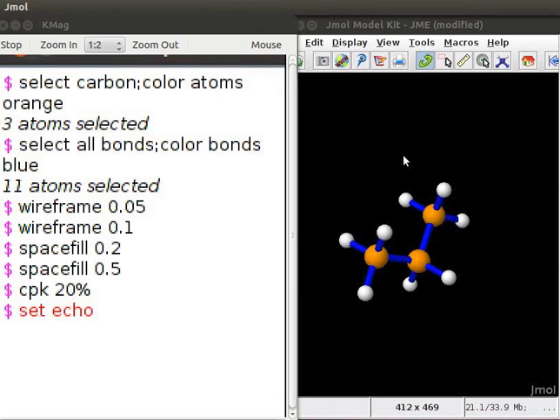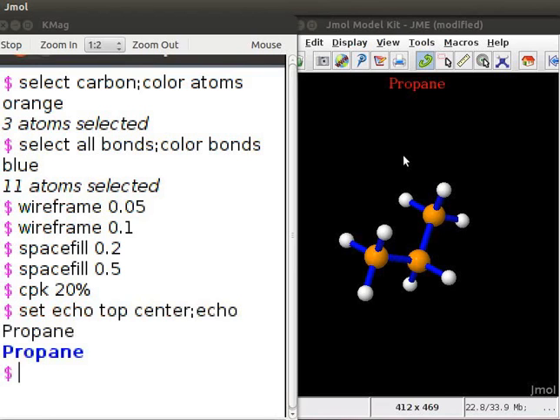So, type set echo top center semicolon echo propane. Press Enter. We can see the text propane displayed at the top center of the panel.